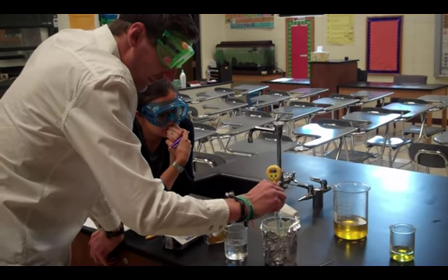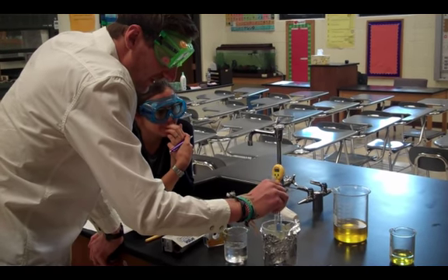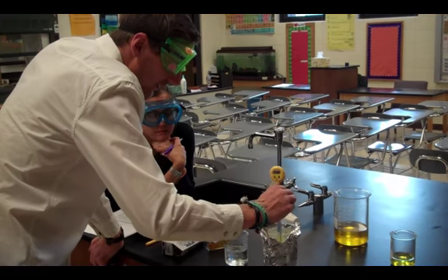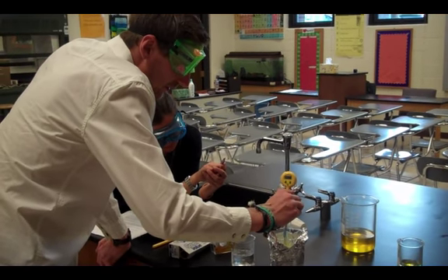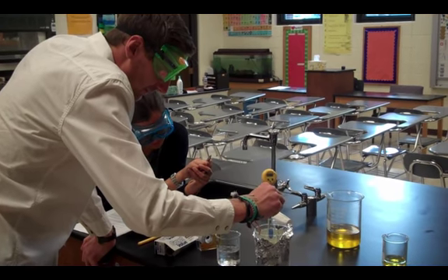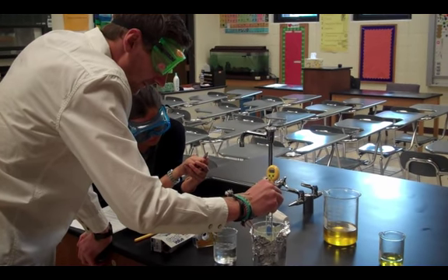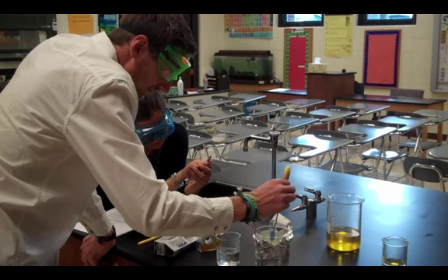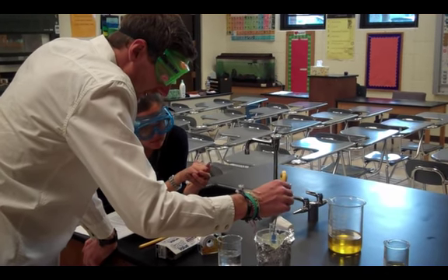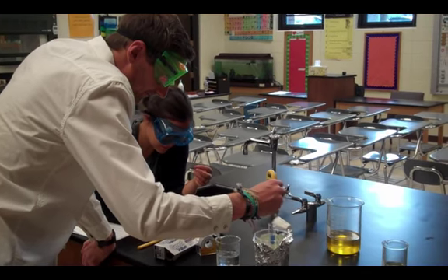record at least 6 values beyond when you first notice the first ice crystals. And you'll continue to stir until this is completely frozen. 7.3.